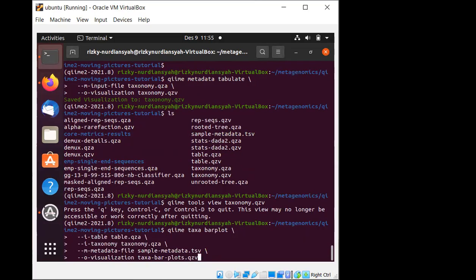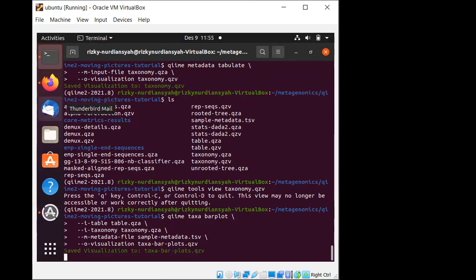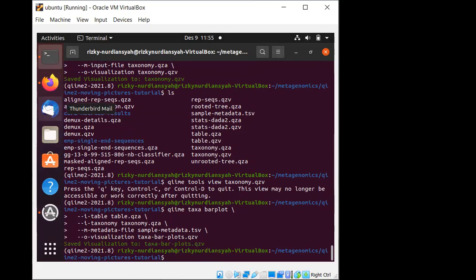Copy paste again, because the command is already provided, and let the magic go. Oh, it's done. That was quick.